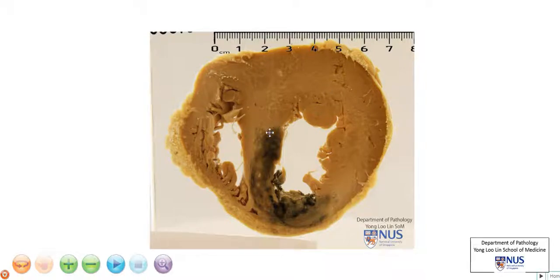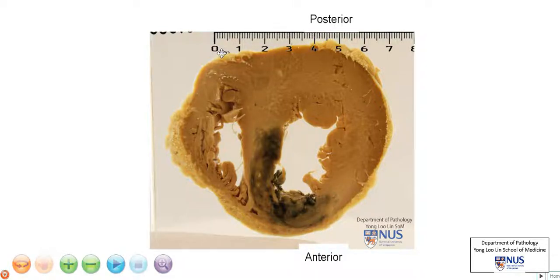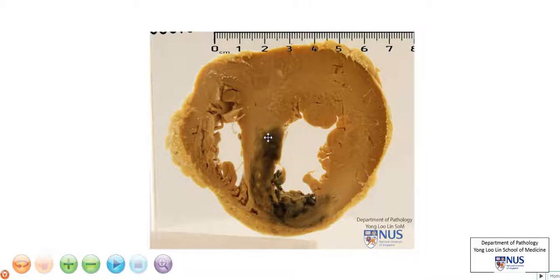Hello. We're looking at a transverse section here of the heart through the left ventricle and the right ventricle. This is the anterior surface and this is the posterior surface. What we can see here is that there is a localized area of discoloration at the interventricular septum as well as the anterior part of the left ventricle.